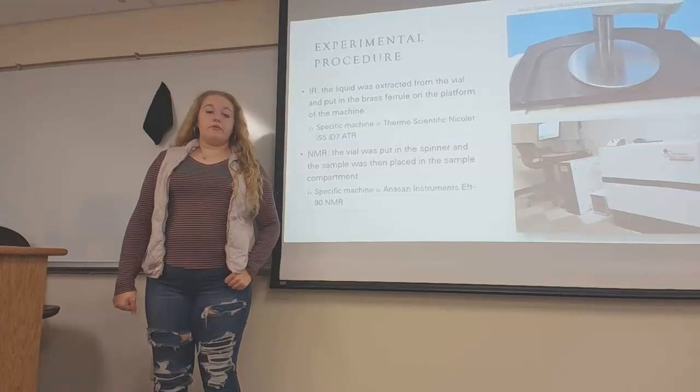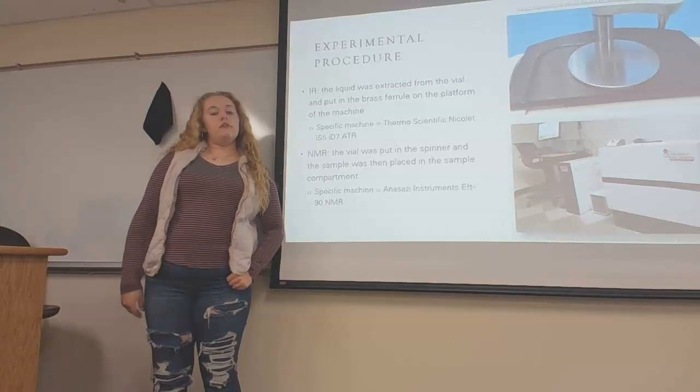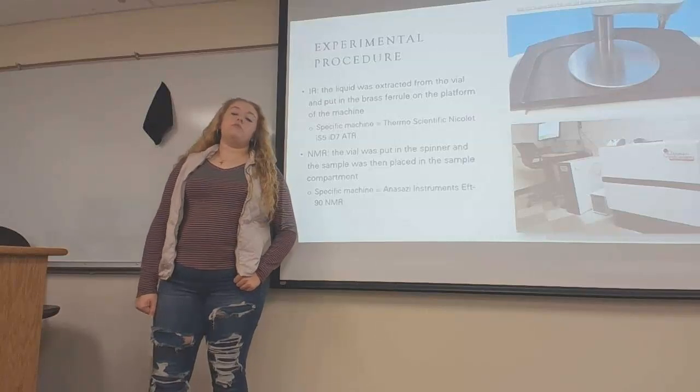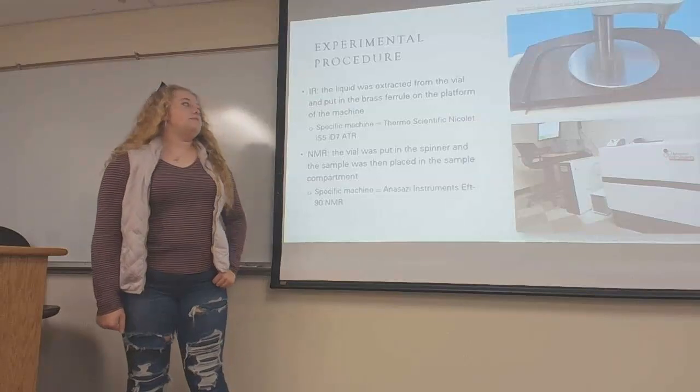From there, the spectra was run and our data was printed after the computer developed the graph. For cleaning, the brass ferrule was placed in a dirty brass ferrule beaker, and all glassware was disposed of properly. To clean the platform, we used a cotton ball and alcohol.